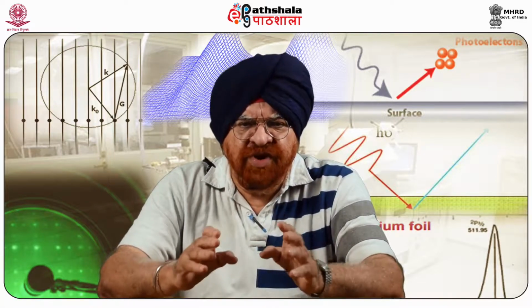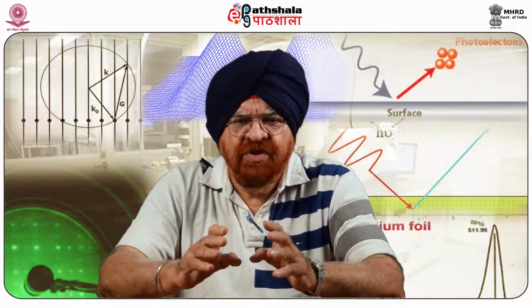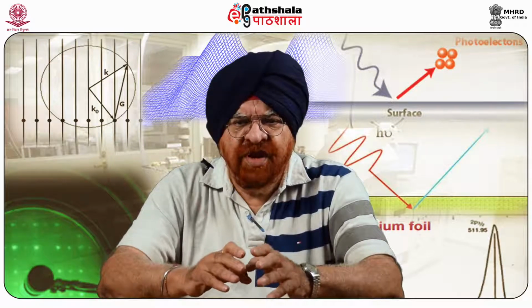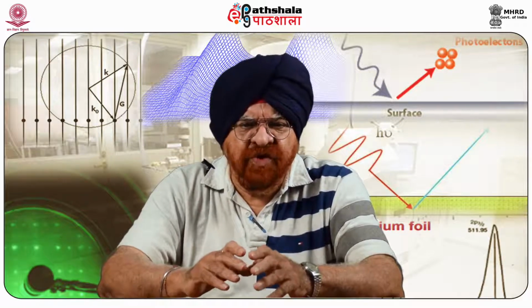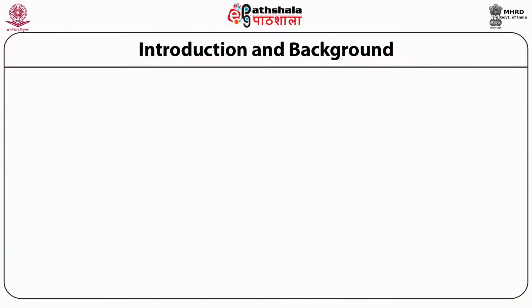These measurements provide critical near atomic size information on processing induced defects and their effects on the performance of the electrical devices. KPFM is also called surface potential microscopy.